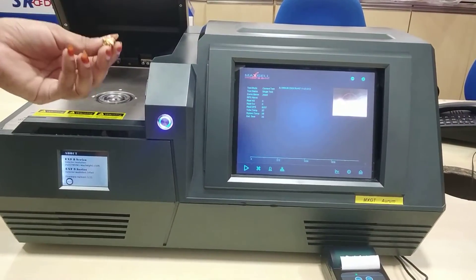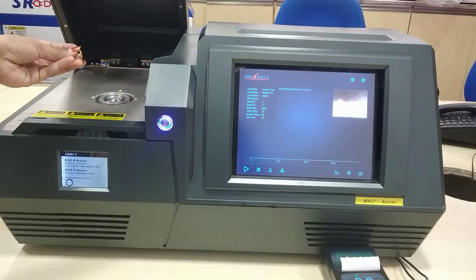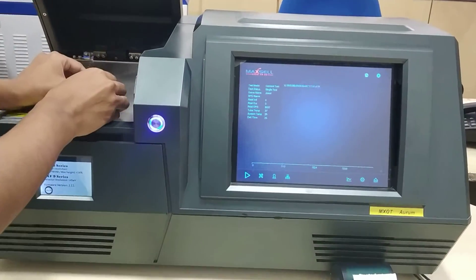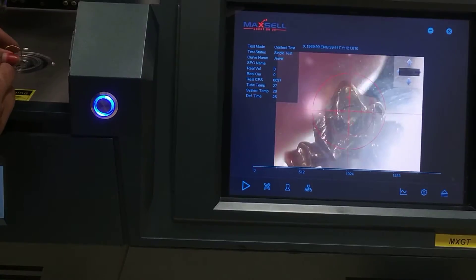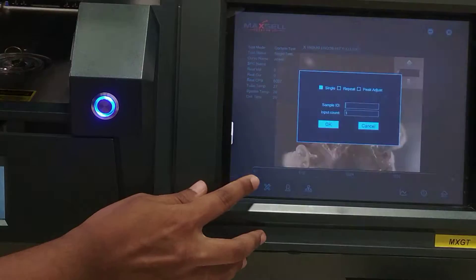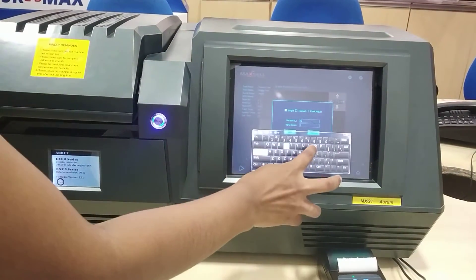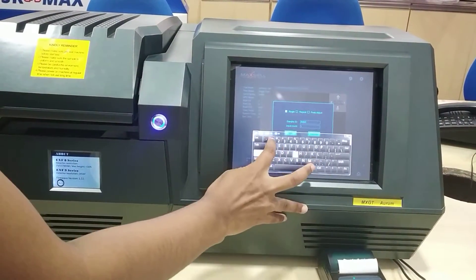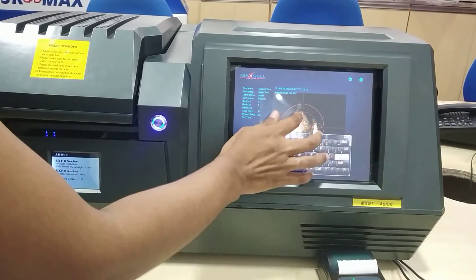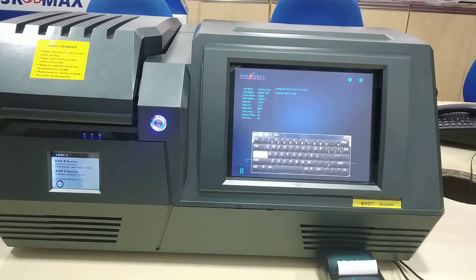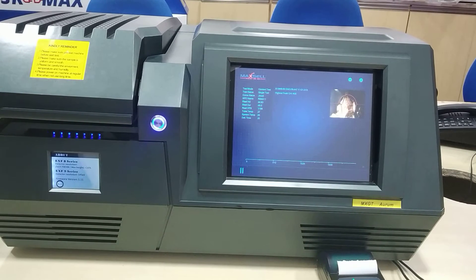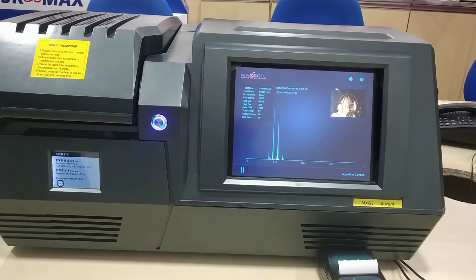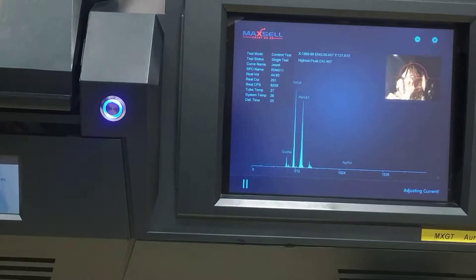Now I'm placing a jewellery piece which is 22 carat. Place it, close it, and give it a name like 'ring 1'. This test will take 25 to 30 seconds.